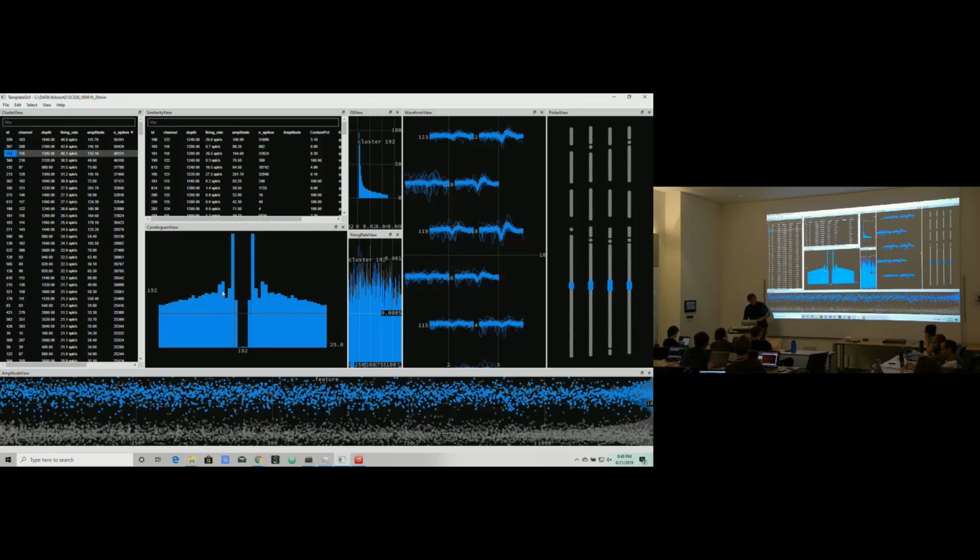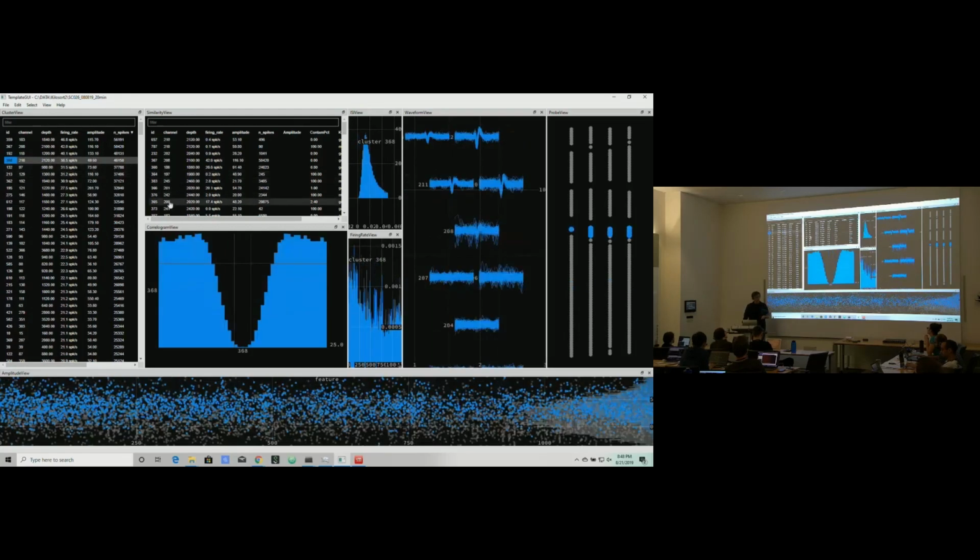However, if this goes up to like halfway or something, that's when you know that you probably have maybe 2 neurons in there, or maybe 1 neuron and some background spikes. Those are going to be the tricky cases where you will build some sense of what you're comfortable accepting as a good unit or not.